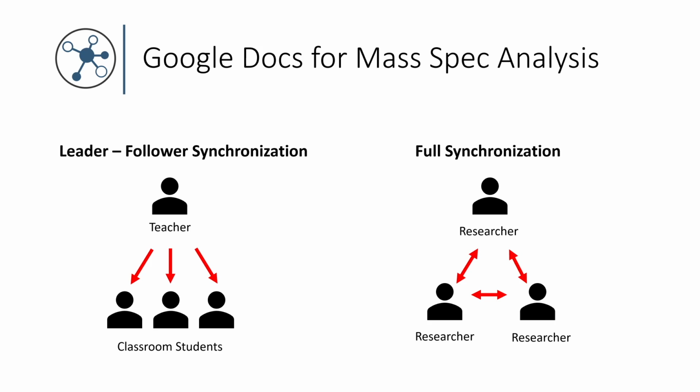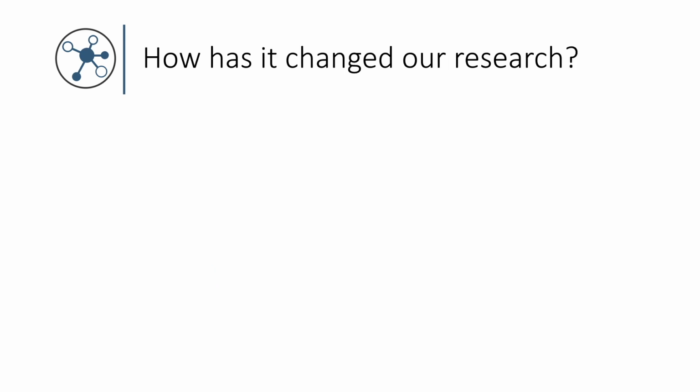But all of you can change the visualization and it'll get automatically propagated bidirectionally to everybody else. And so these are the 2 synchronous modes that we hope will encourage education, data sharing, and just inspection in general. And so I want to kick it back to Danny, and he can talk a little bit about how it's really changed his work and our vision on how we can change the field going forward.